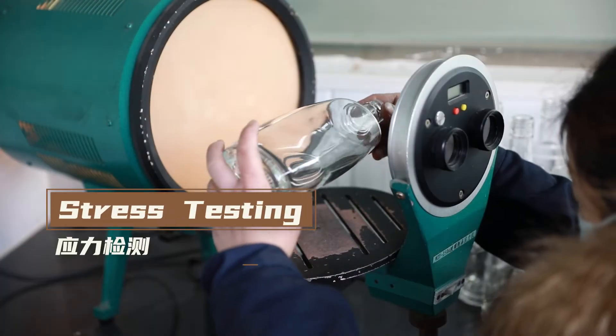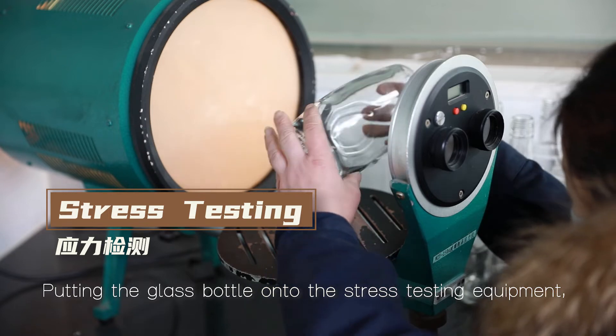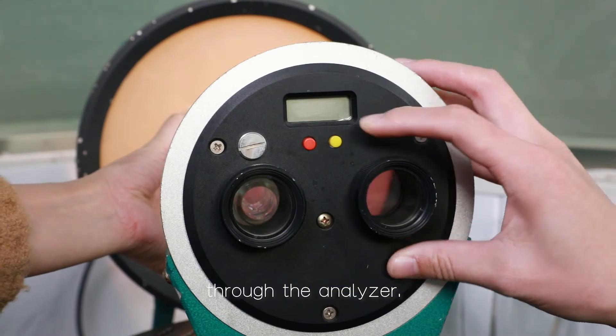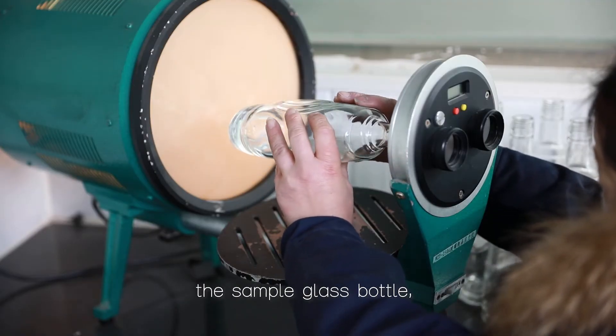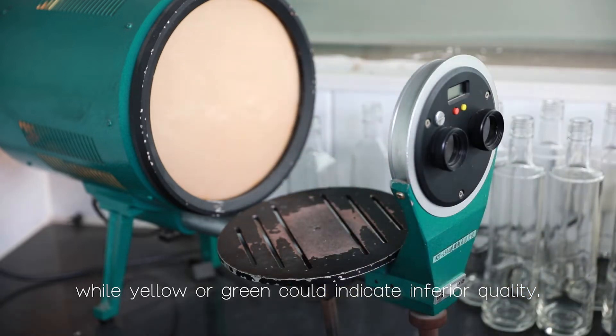Stress testing. Putting the glass bottle onto the stress testing equipment, our testing specialist conducts the polarized observation through the analyzer. Purple or red is the sign of proper anneal quality of the sample glass bottle, while yellow or green could indicate inferior quality.